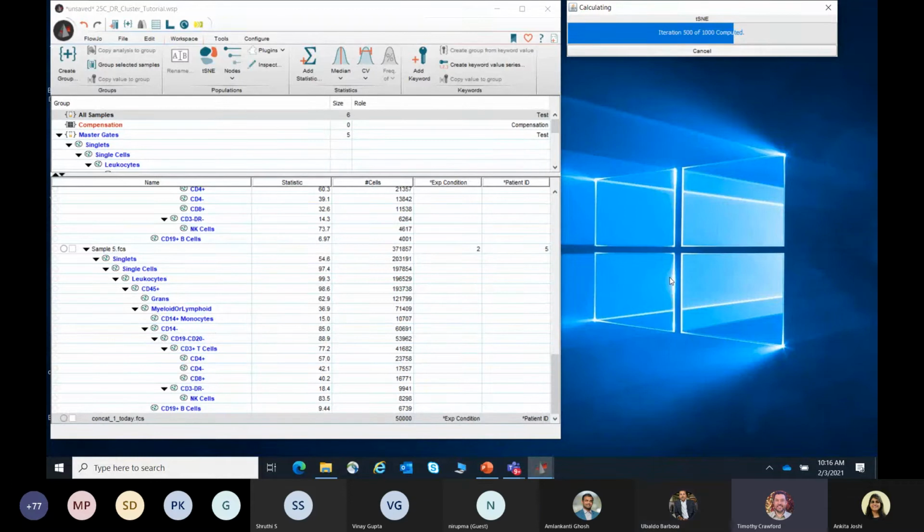That is just an optional cleanup step that should be performed at the level of the sample when you first bring it in, and then you work downstream of the good events gate that comes out of that. When I show my screen, I will show you an example in FlowJo of where I've used Flow AI prior to the concatenation step. So it is part of the cleanup. You do it before you're gating, and you work with the good events that come out of that as the clean sample.